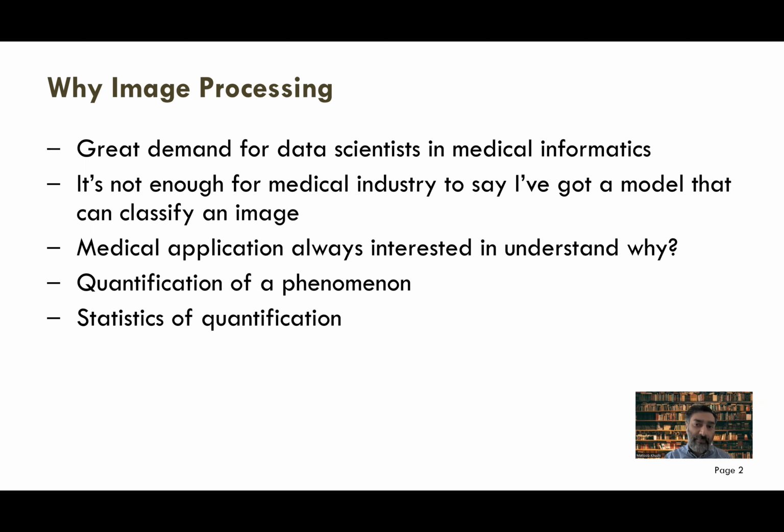You apply that drug, and then you look at the images using microscopy or other advanced methodologies. You see there's a difference before and after the drug application. You might see the cells have grown, or the cells have shrunk.